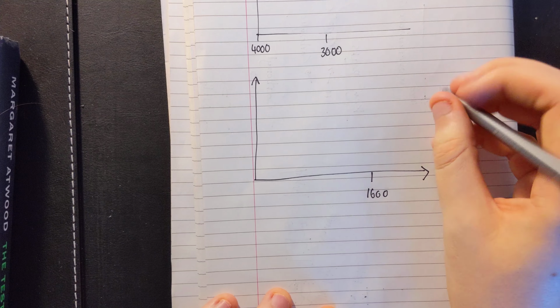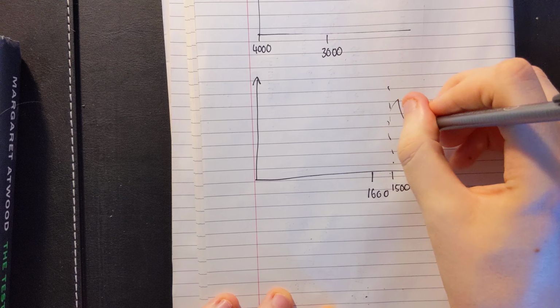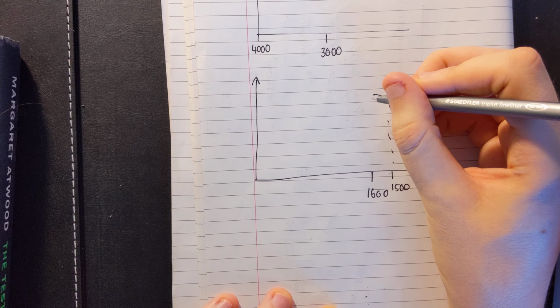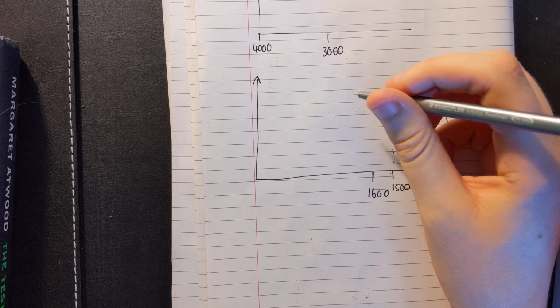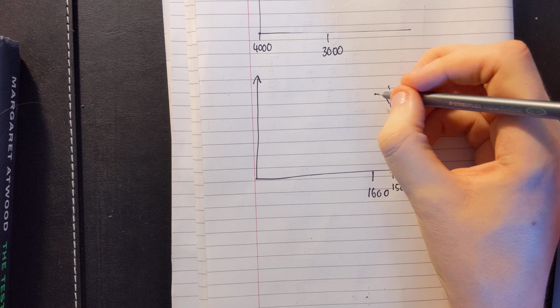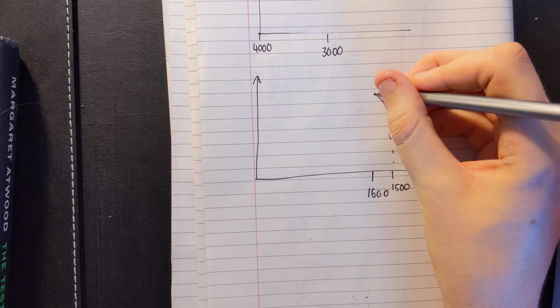Now, if I draw, so we've got our fingerprint region, got a bunch of messy stuff in there. It's not a very strong absorbent. So all these other ones we've seen before, so the alcohol, the OH group, and the carbonyl, they're very strong absorbents if they go a long way down to the bottom. The alkene one is actually quite a weak absorbance, so it only goes down maybe to about around down here.